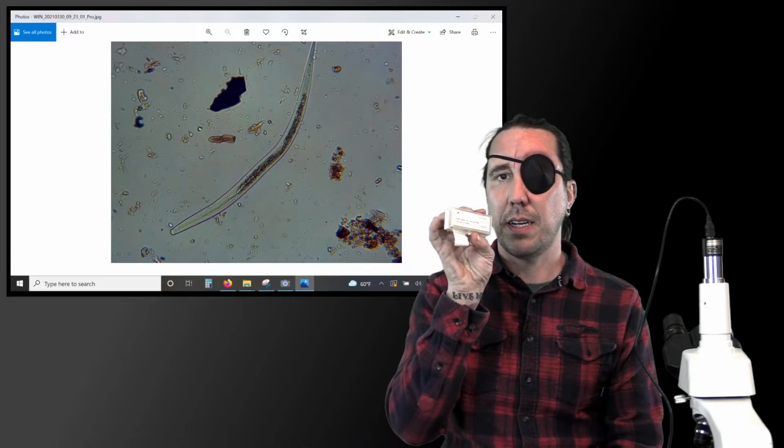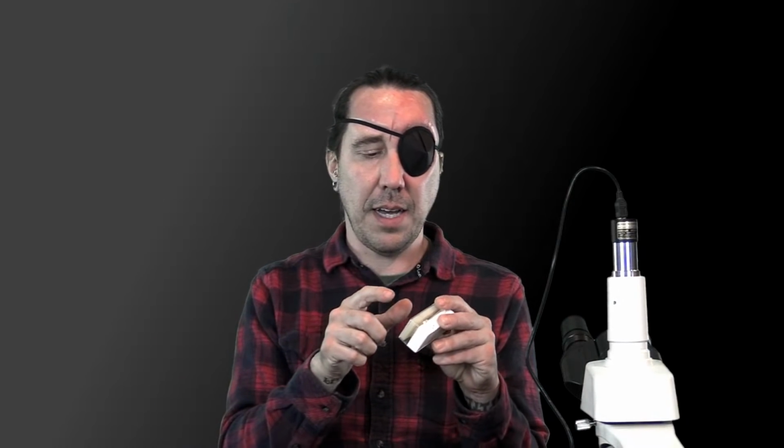And then you got cover glasses that are what goes on that. The size that I have here are 18, so that's the size of the square, 18 by 18 millimeter. Generally for doing these counts, use either the 18, 19, or 20 millimeter size of the cover glass. And these are from Azer Scientific as well.